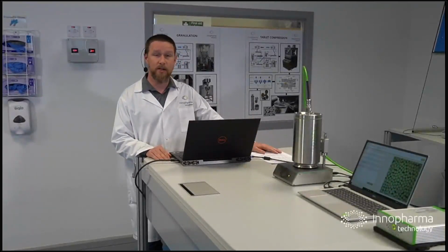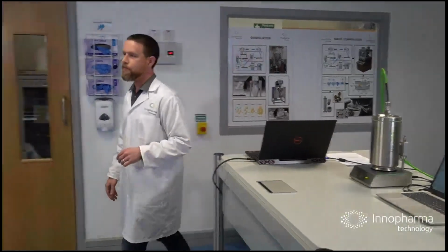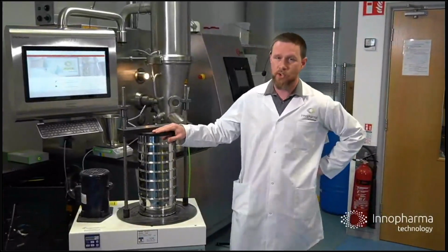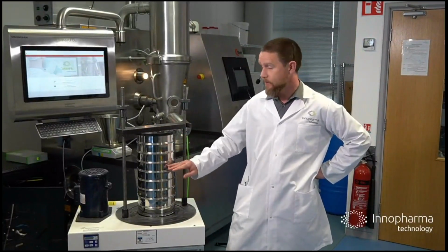This is where we test all our analytical equipment. We also do a lot of solid oral dose processing here as well. If I take you over here, we can actually see the aforementioned sieve analysis. I'm sure a lot of people are familiar with it, but it's basically just to show in real life what it is. Essentially, sieve analysis is a stack of sieves, varying grades of different sizes.